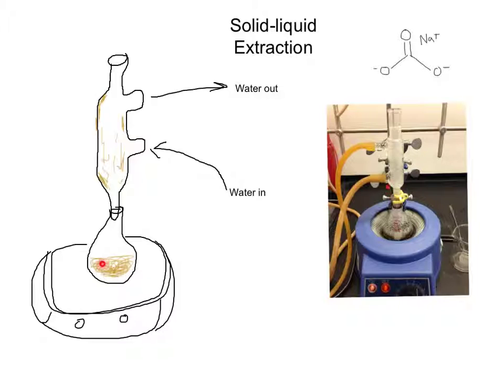As we can see here, a similar setup as distillation was set up. However, the whole theory or procedure was different. Instead of collecting the distillate here in the water jacket condenser, we allowed it to recondense and move downstream again and recollect it. We weren't purifying it or anything. We were just recollecting the vapors or the solution that was vaporizing.